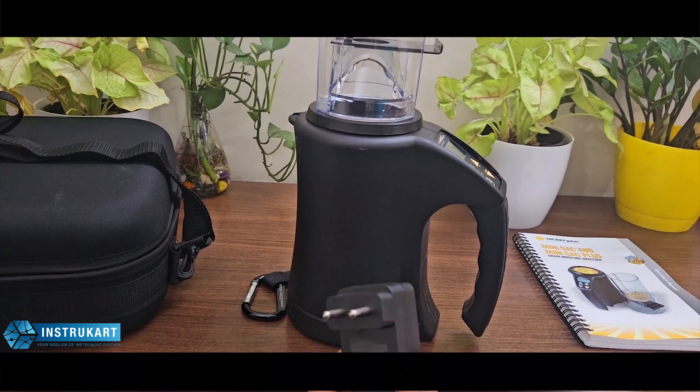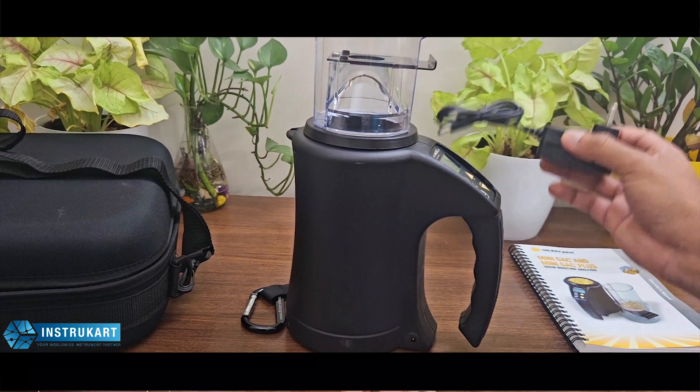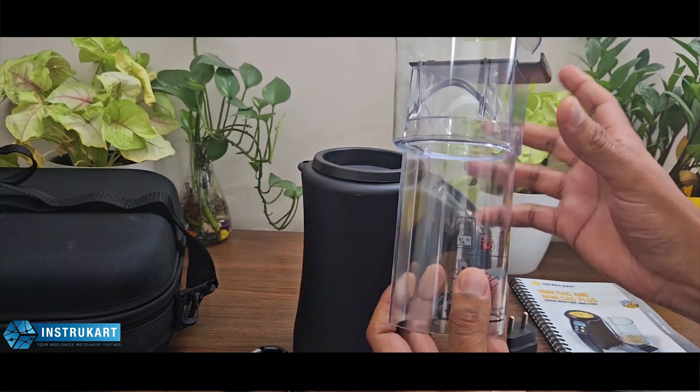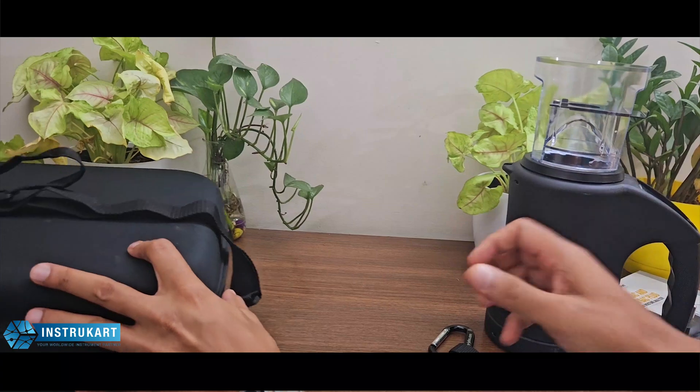What comes in the package: it comes with the loader, a charger, a clip, an accessory to load the grain, and finally a carrying case.